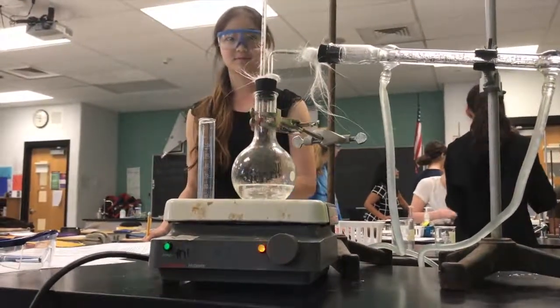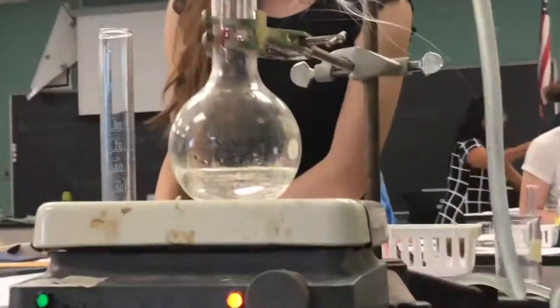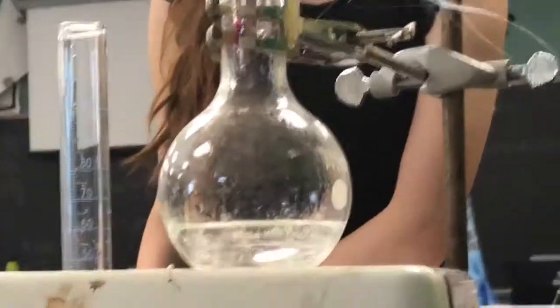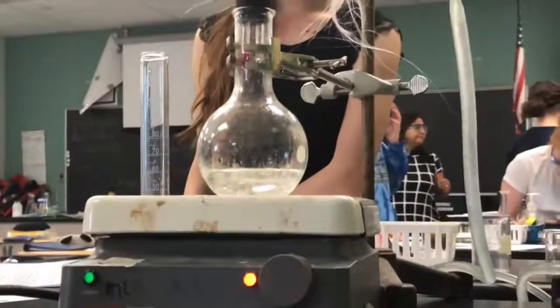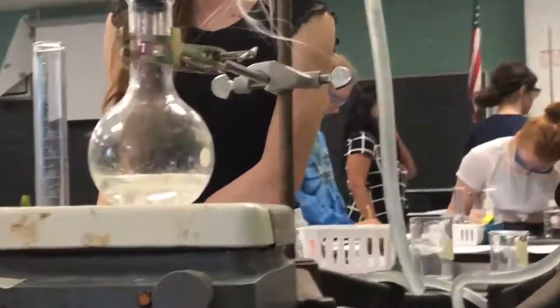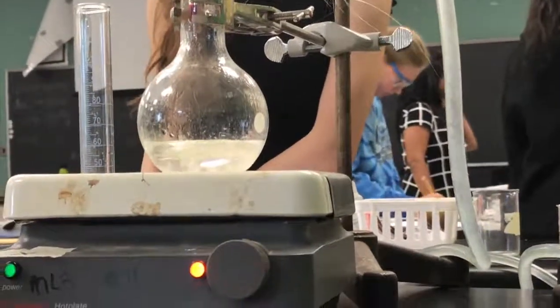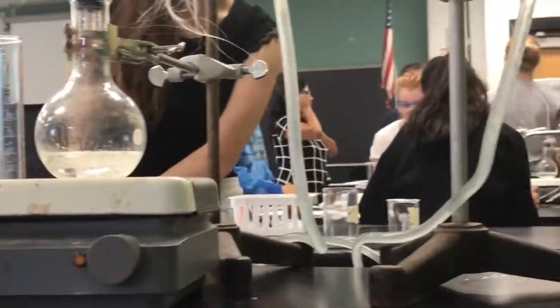In this lab, we used a setup of a flask with a thermometer in it on top of a hot plate, which was set to 5. The flask and the condenser were connected by glass tubing, and the condenser was where the substance was condensed and turned into distillate, which was caught inside the beaker that was sitting under the condenser.